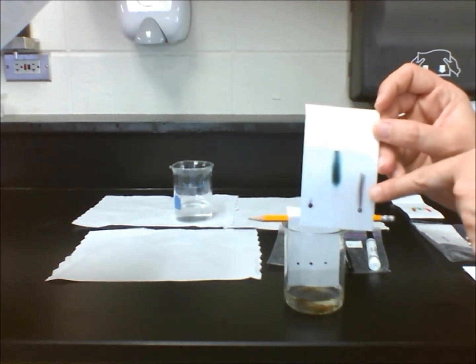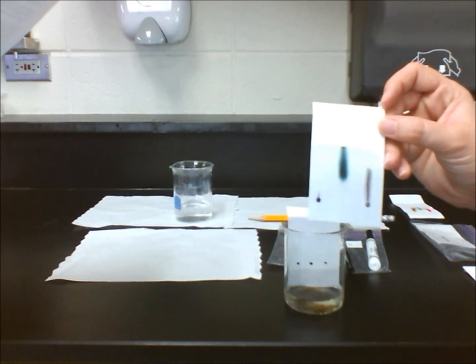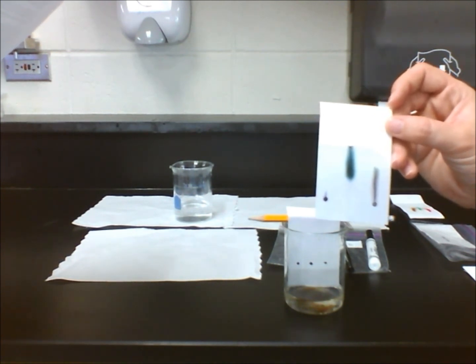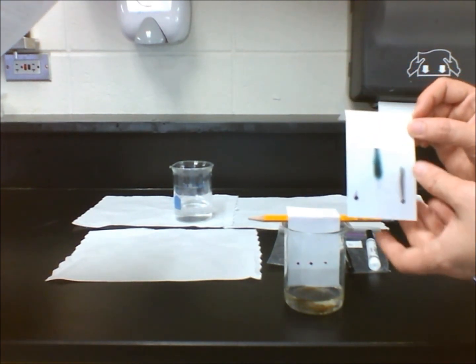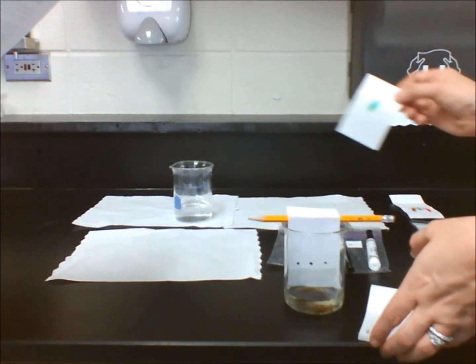Think of the yellow and blue dyes from the green ink in lab 17.1. The blue dye was more soluble than the yellow dye because it moved up faster on the chromatography paper.